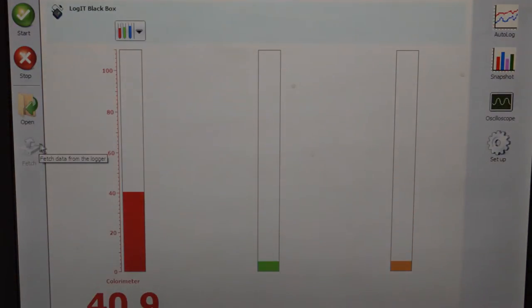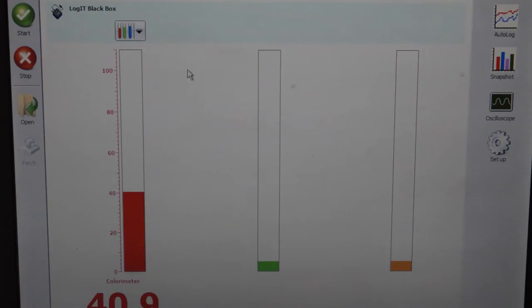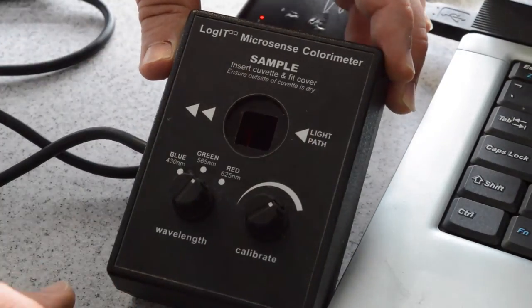Using the colorimeter, open up the Sensor Lab program by double clicking on the icon on the desktop. Then proceed to the drop down bar and select the third item on this menu, which is smoothing colorimeter calibrating a colorimeter.